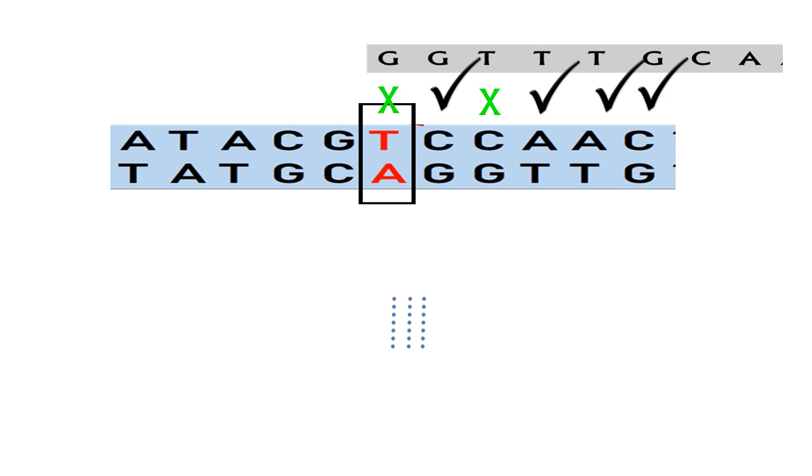We have another scenario where the primer is not able to get attached because there are two mismatches in this primer. First, the end nucleotide is not matched with the nucleotide we want to screen in the DNA sequence. Secondly, there is a mismatch in every primer.